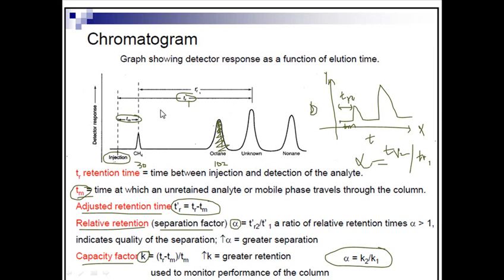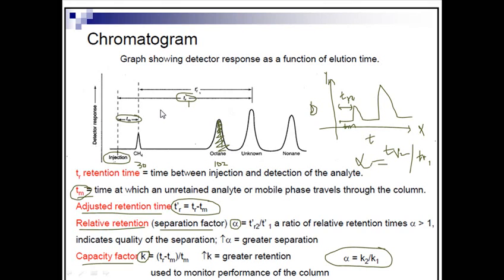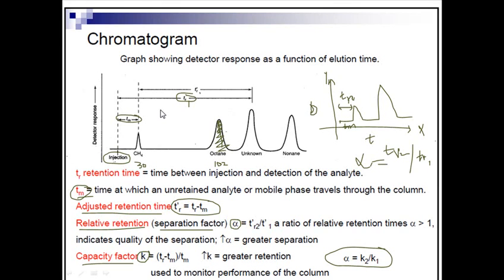So if we find only the peak in time, we can use it in qualitative analysis, but if we want to do quantitative analysis, we need to look for the peak height, and more exclusively the peak area, which is the area under this peak.